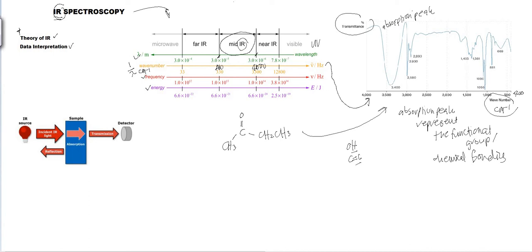Okay, so IR spectroscopy ni, other than that, sebelum kita go for the instrumentation, so you know that you have the molecule, for example, ataupun you have the molecule that you didn't know what is the chemical structure, ataupun kita kata what is the functional group involved, you want to make a confirmation. So usually IR is the best instrument to send your sample lah.